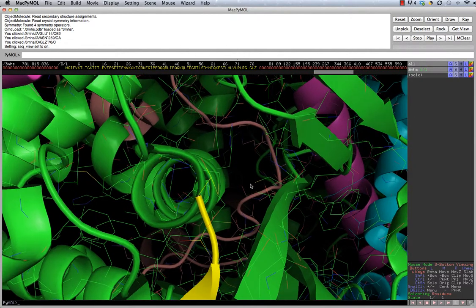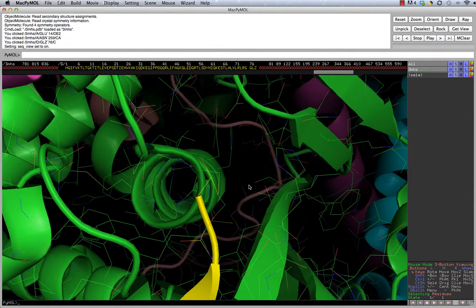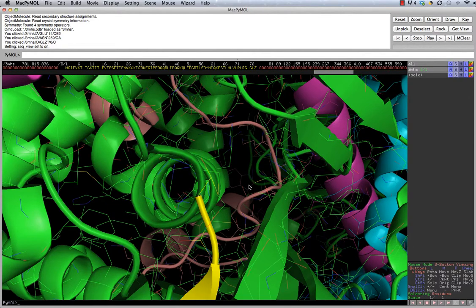Now this is really confusing looking. There's still an awful lot in my plane of view. So we're going to teach you about another thing you can do to simplify this, and that's your use of the center wheel. So I showed you how to use the wheel to center click and center on an atom. You can use the center wheel to limit the slab. That's in the depth, think of a line going through the center of the screen. There's a certain limit of the front and back that's come in view.